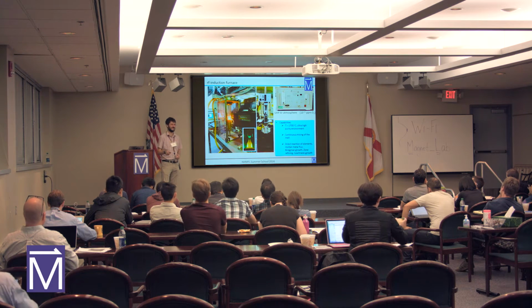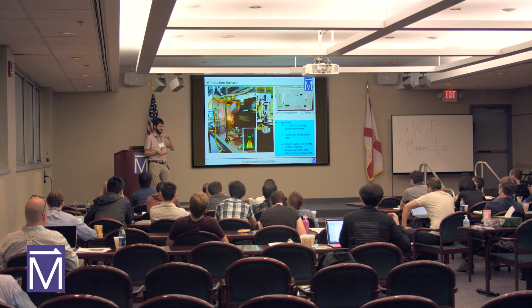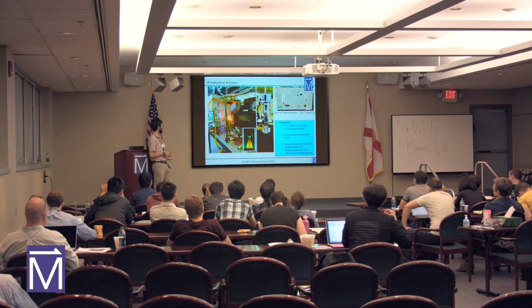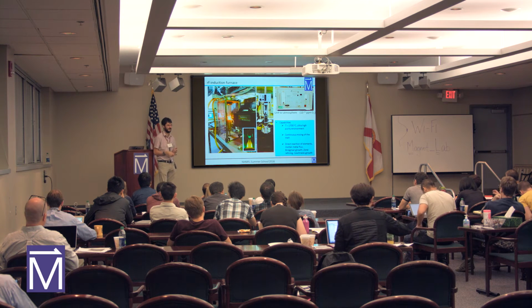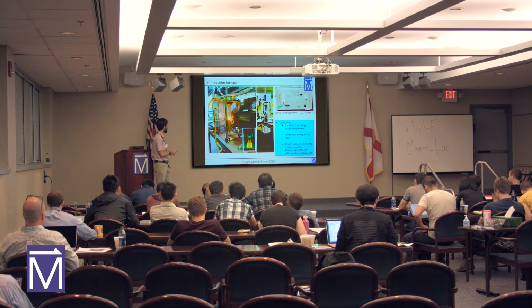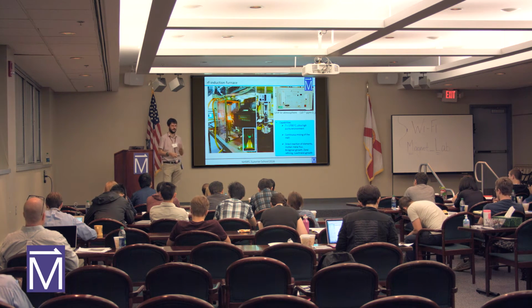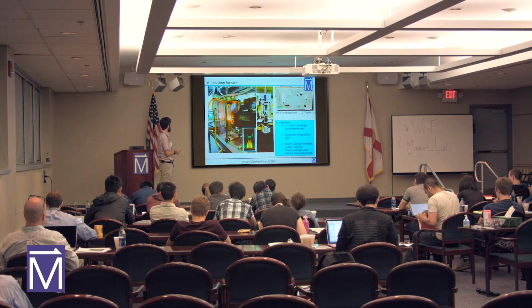But, and I'm just kind of going fast, we can talk more later, if you want to grow large single crystals of intermetallics, you can use something called the Czochralski crystal growth technique. Okay? And we're actually building such a system here right now. Typically, these systems are very expensive and large, and not many places have them. But the idea is that if you can heat your metal, which is in this hot zone here, and it's actually this bit down here, if you can heat that above the melting temperature, and you might do that using an arc furnace setup, or in our case, we're using an RF furnace setup.